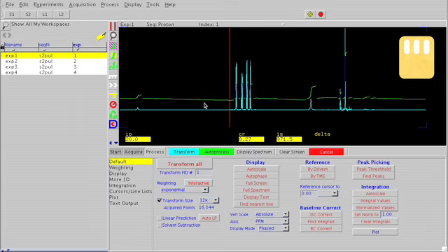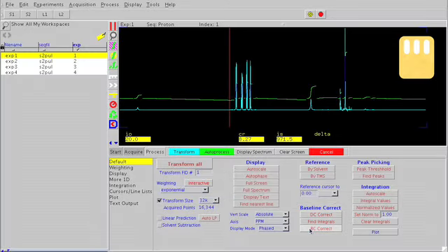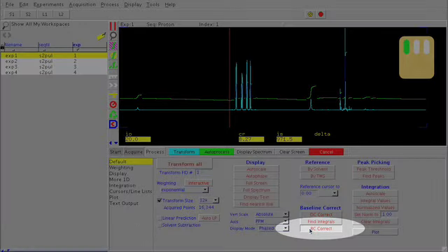We can see that the integration is not level through the spectrum. Clicking DC corrects some of the tilt to the spectrum. Since we've already integrated all the peaks, we can use BC correct. The integration is now flat after doing the BC correct.